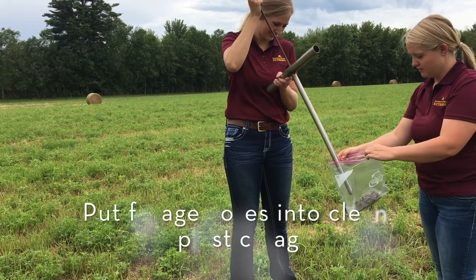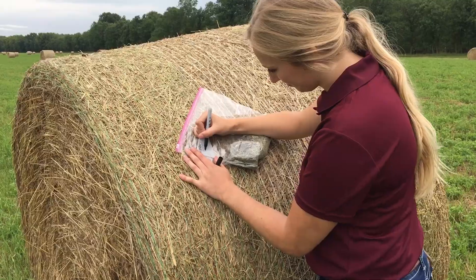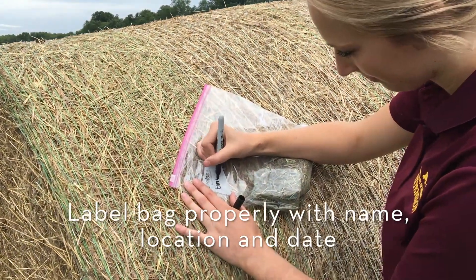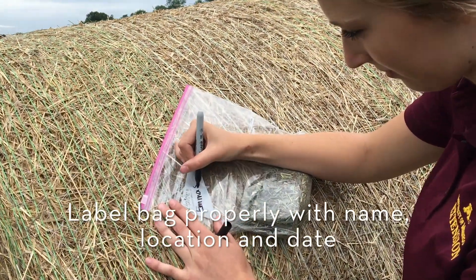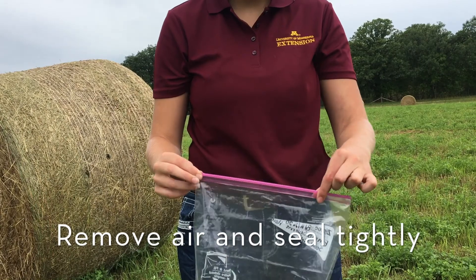After collecting the forage sample, place the cores in a clean plastic bag. It is important to label your bag properly with your name, location of the field you collected the sample from, and the date. Remove as much air as possible and seal the bag tightly.